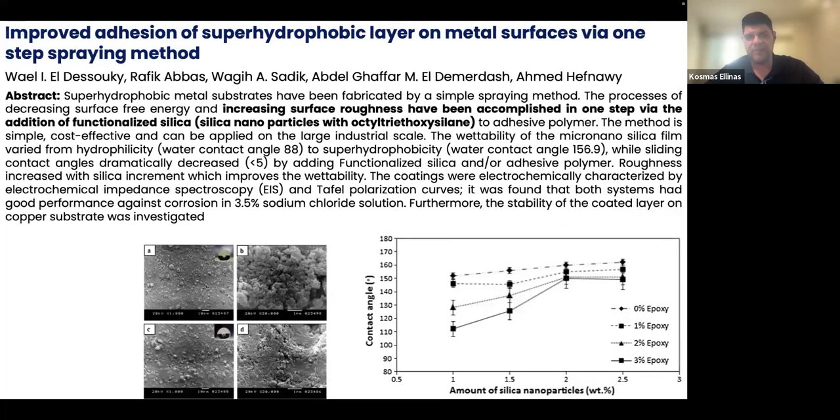Again, another method. Here they were spraying some silica nanoparticles with octyl triethoxysilane in order to have this kind of topography.